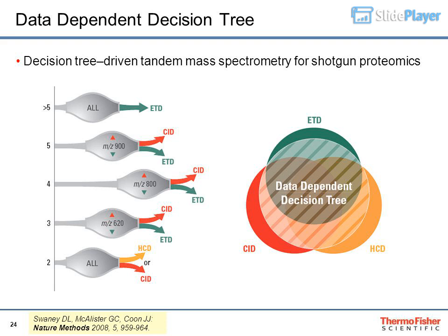Decision tree-driven tandem mass spectrometry for shotgun proteomics. Now, let's have a look at the behavior of phosphopeptides at harsher collisional conditions, such as those experienced in a quadrupole or multipole TOF, or HCD on an Orbitrap. The above examples are fragmentation by HCD, when the high-resolution tandem mass spectrum of the phosphopeptide was obtained in the Orbitrap analyzer of an LTQ Orbitrap Velos, Thermo Fisher Scientific.